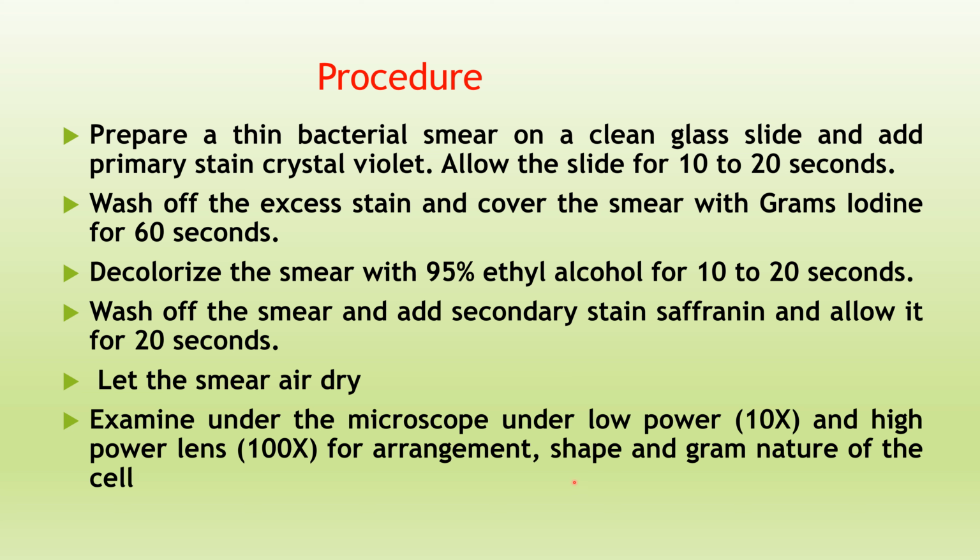And what are the lenses we need to use? First we need to focus under the 10x lens, and then we need to increase the power of the lens to 100x. Whenever you are using the 100x lens, you need to go for oil immersion. So you need to put some immersion oil and examine under the microscope.